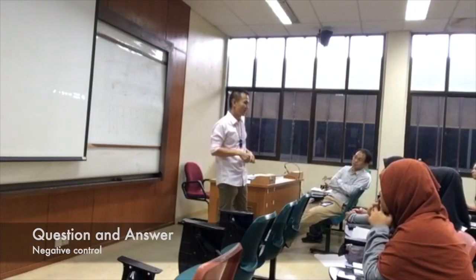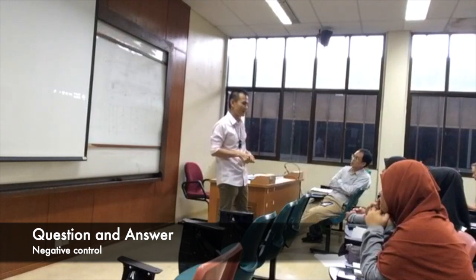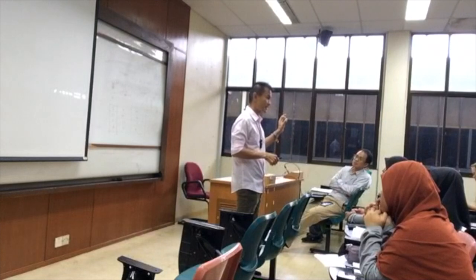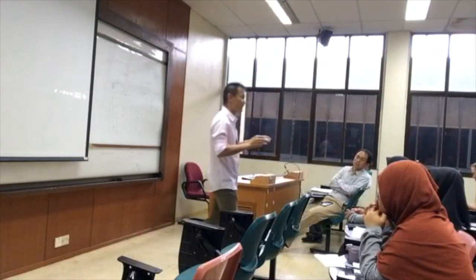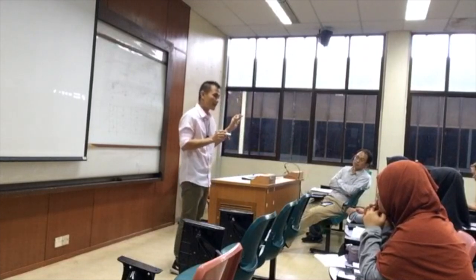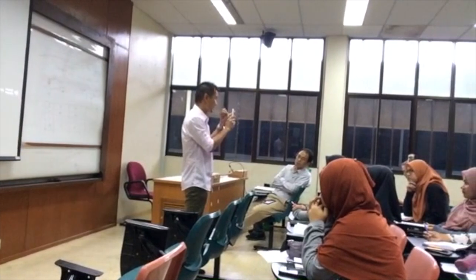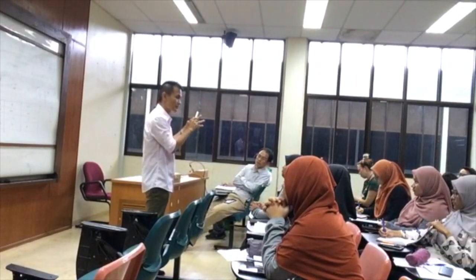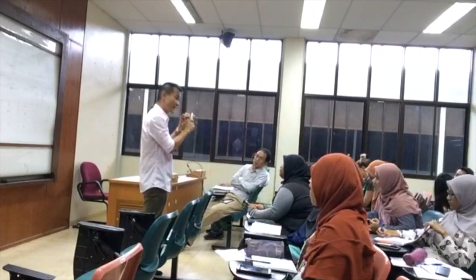Basically, there's no such thing as the positive control being contaminated by the negative control, because in the negative control you don't have anything inside, just water. Normally, for the negative control, you mix your primer, free nucleotides, and enzyme, but there is no DNA there.